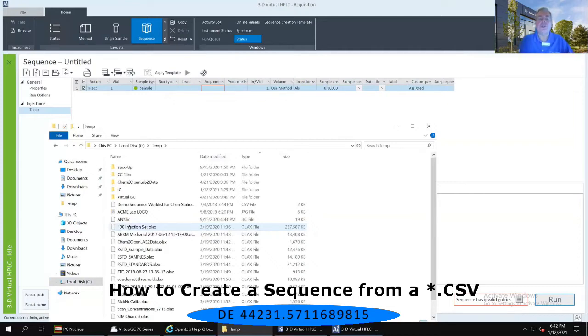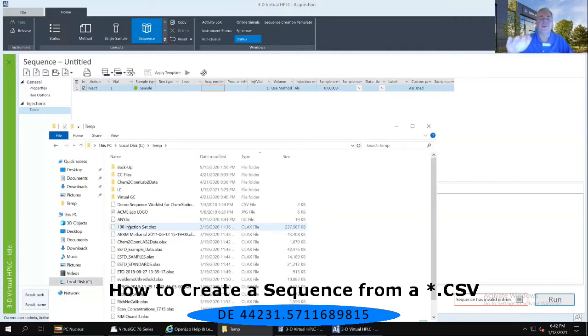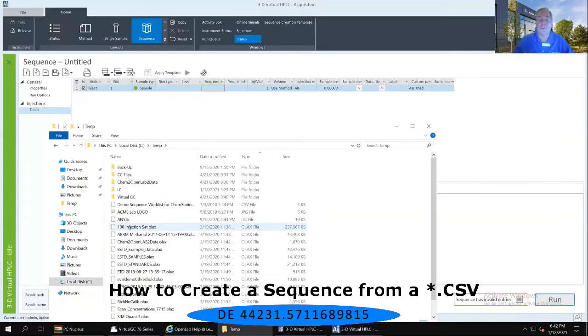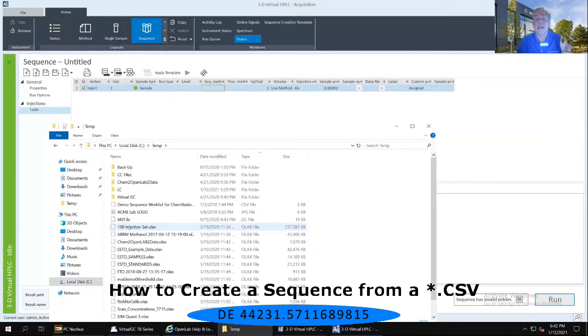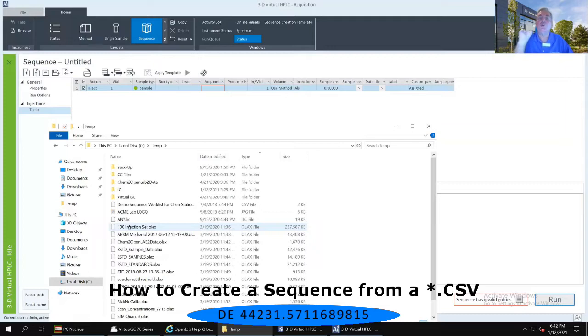And you should see the very first file, just after the icons for the file folders that are there for backups, CC files, et cetera. The very first file is entitled Demo Sequence Worklist for ChemStation, should be ChemStation2.csv. Do not double-click on this.